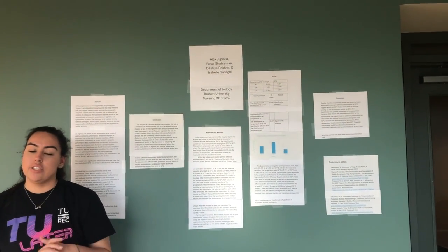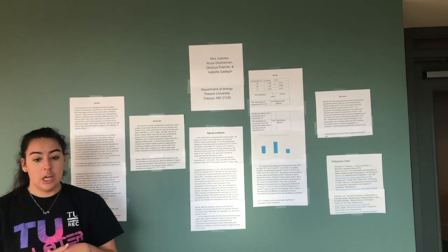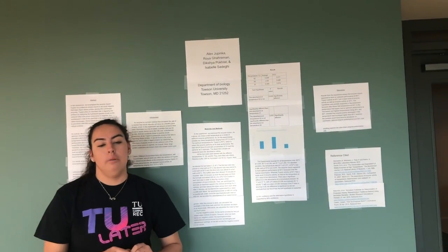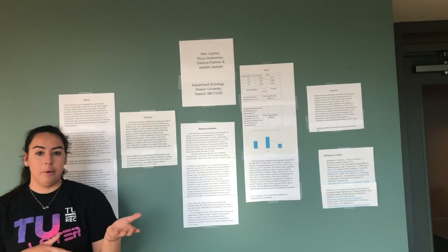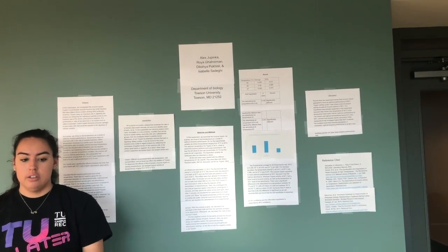We maintained a pH level of 9 because the three other groups that tested pH, their experiments did prove that 9 had the optimal results because trypsin had a better performance in a higher pH rather than lower, and much higher than 9 showed to denature their enzymes.